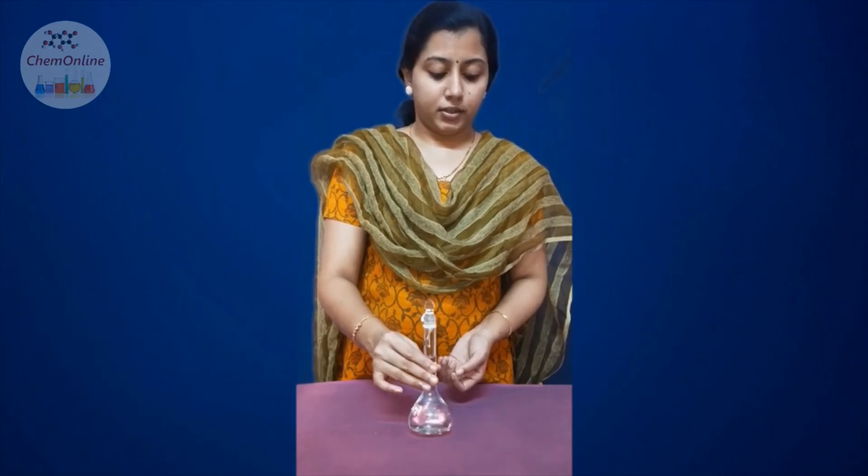After that, close the standard flask with the glass stopper and shake it well so that the solution will be homogeneous. This is how we prepare the given solution to a 100 ml solution using a standard flask.